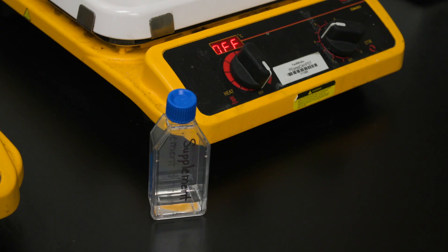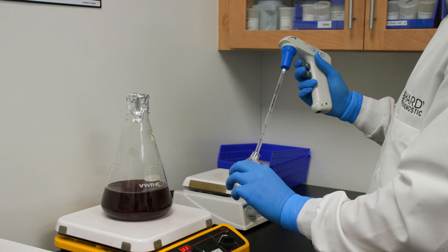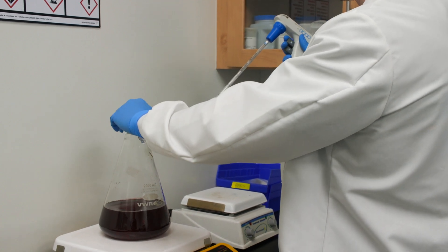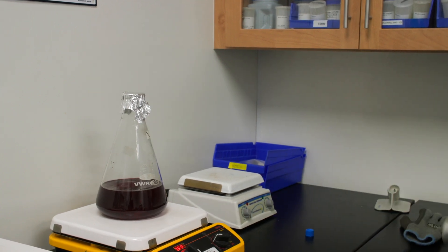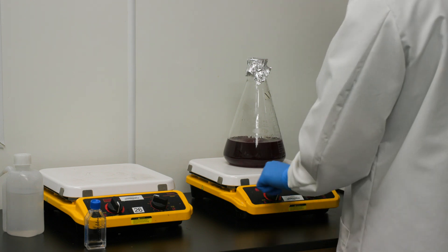If your media formulation calls for the addition of supplements, add them aseptically now. Ensure the supplement was filter sterilized through a 0.2 micron filter before adding it to the flask. Make sure the supplements are first warmed to about 30 degrees Celsius before you add them, otherwise chipping of the agar can occur.